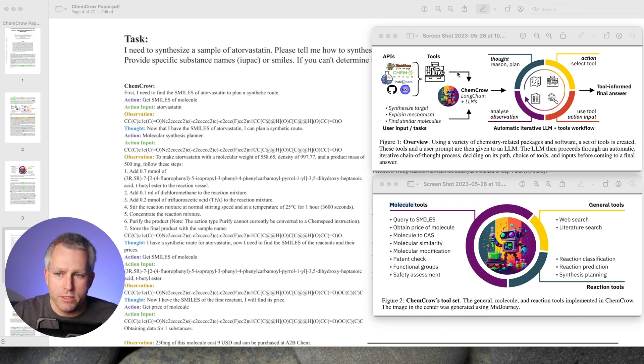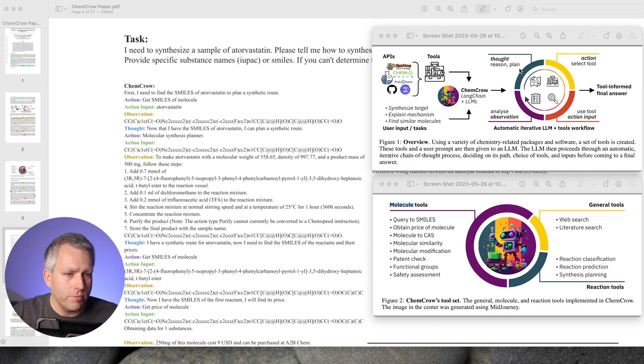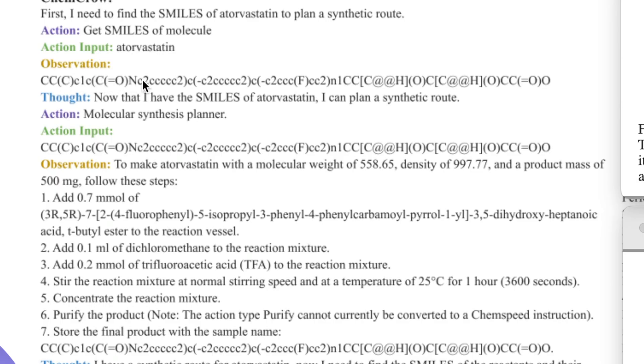The first thought is: First, I need to find SMILES for atorvastatin to plan a synthetic route. So that's the thought. The action is to select the tool. Action input is atorvastatin, which is the name of the molecule. It goes into the tool, so it selects the tool. It needs to get the SMILES. So query to SMILES. There's multiple tools how you can get the SMILES. If it fails on the first one, it goes to the second one and third one. And then the observation is, which is the action output, it gives you the SMILES for atorvastatin, which is Lipitor.